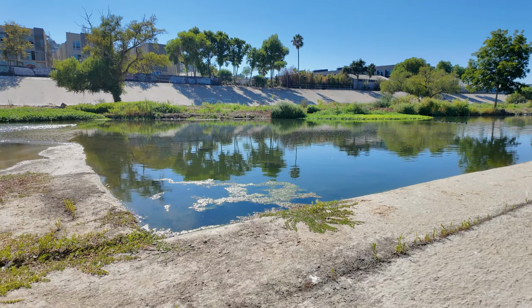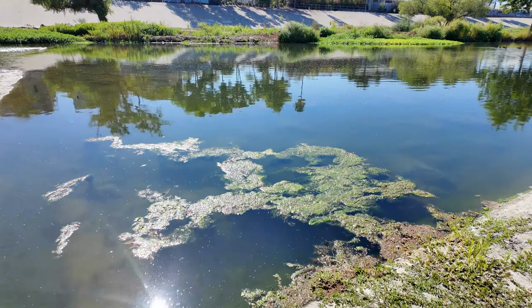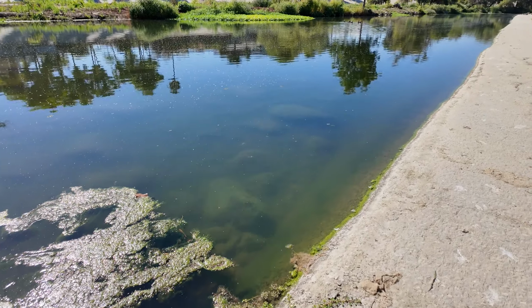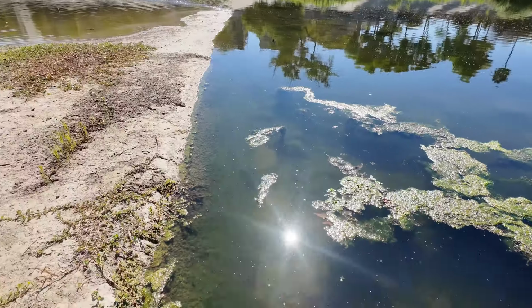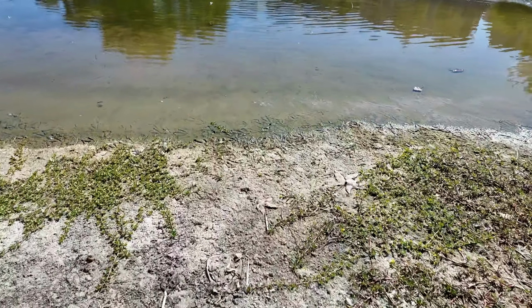Okay, so here's an interesting stretch of river where we can see that on this side, it's a little bit deeper and still quite stagnant. And if we move to this area over here, it's quite shallow and we can see the sandy bottom. So this gives us an opportunity to pretty easily see how much the TDS values can potentially vary inside the river. And I will also try to get to an area that's flowing significantly more and see what those values look like. So let's get started.